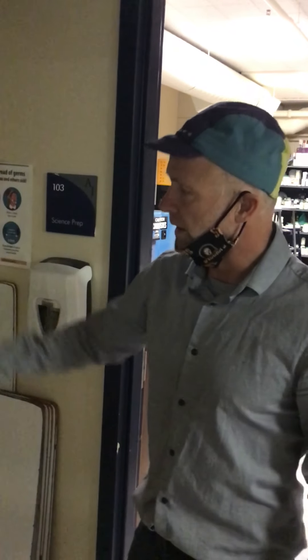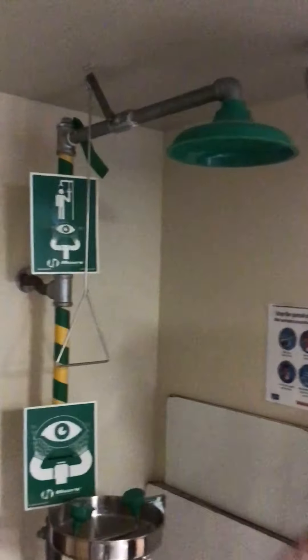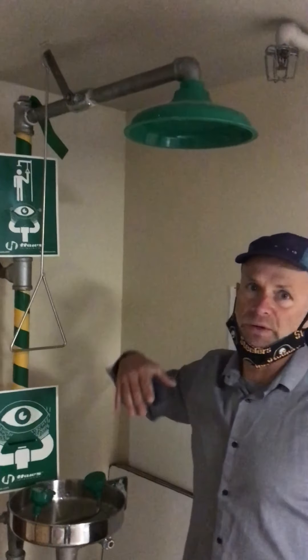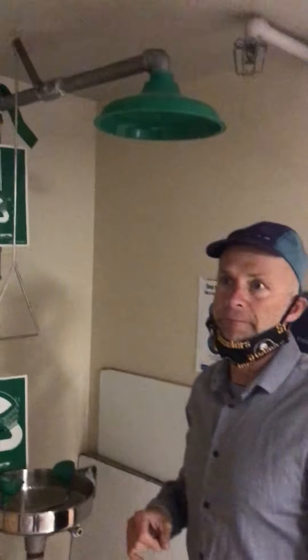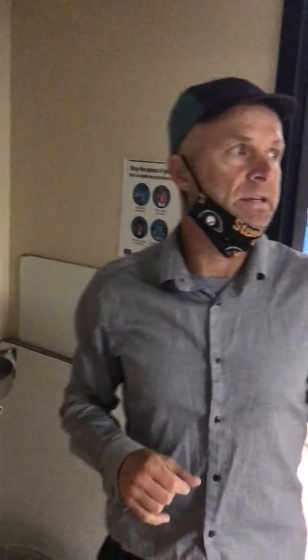There's also the emergency shower. The emergency shower is much more serious — if you should get something on your body that you can't get off in the sinks or at the eyewash station, you're going to come under here. You're going to pull this triangle down and that's going to open the valve and let water out.